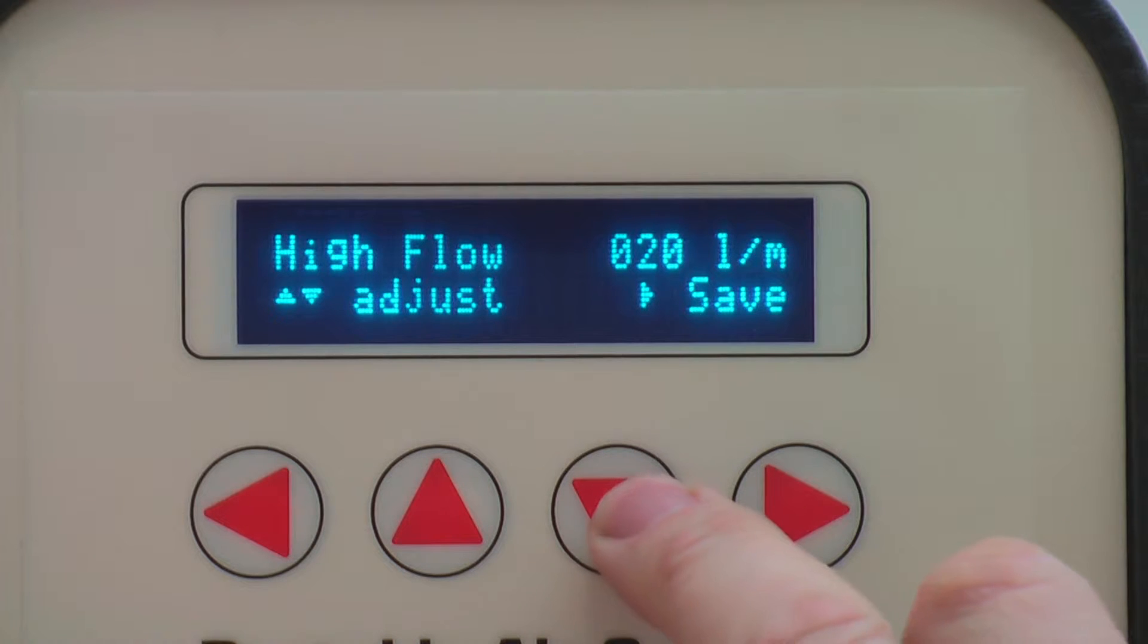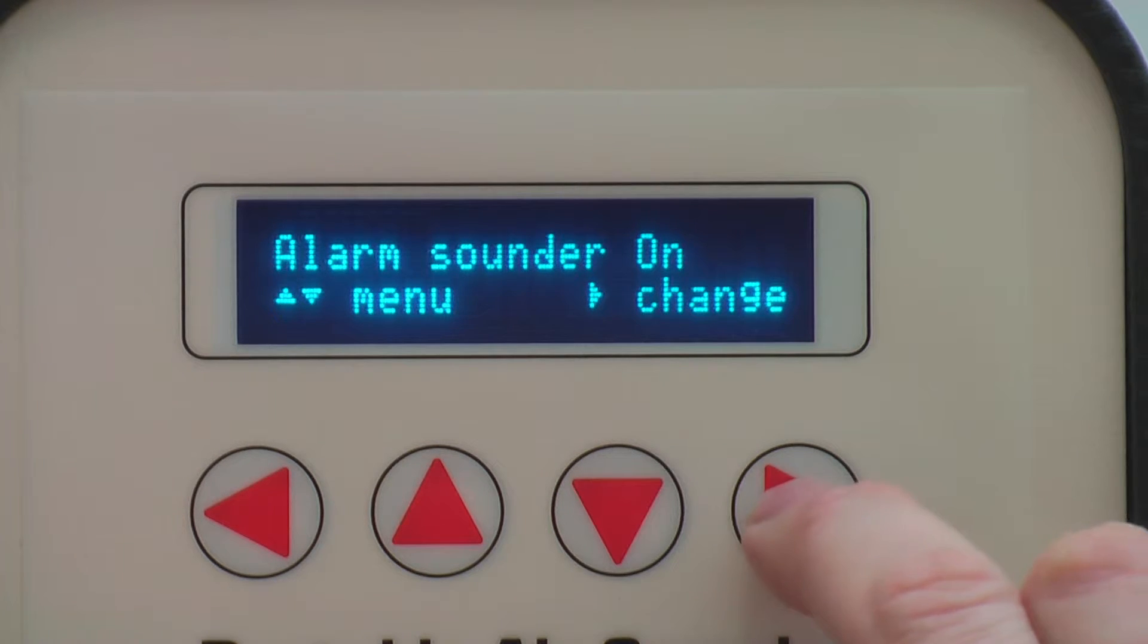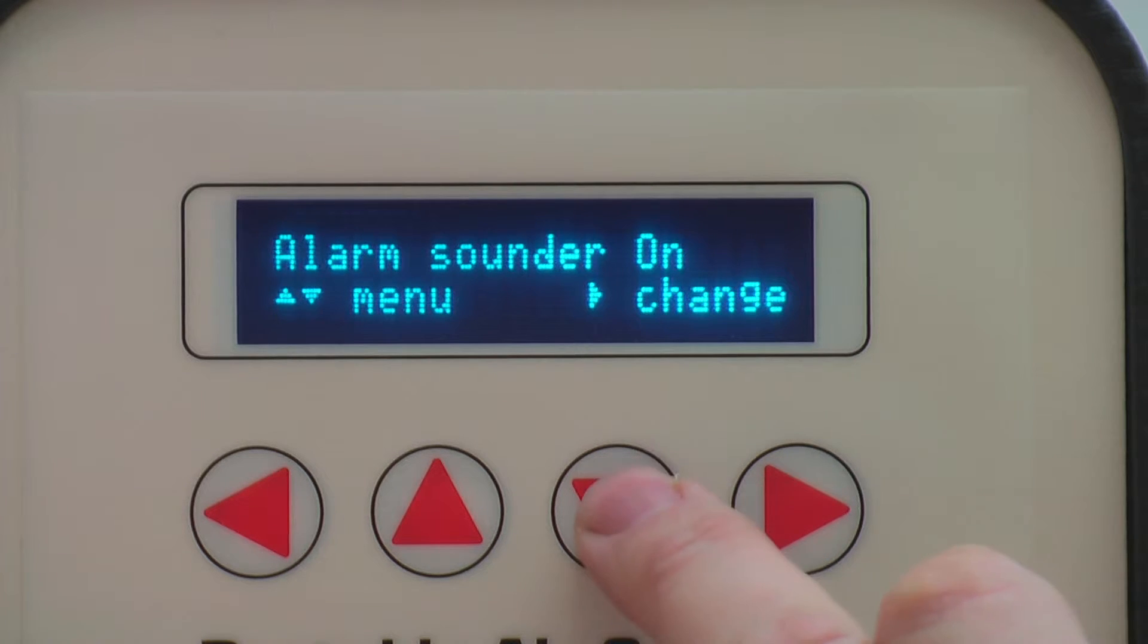You can choose whether you want the alarm to be silent or activate a buzzer when alarm criteria has been breached. Press right to change the settings, up and down to turn the alarm on or off. Pressing right again will save the new configuration.